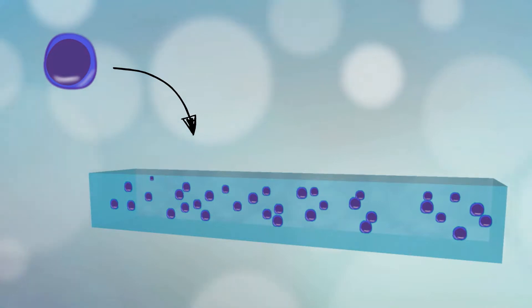Stimulated cells are introduced in a hydrogel and placed on a multi-channel microplate, all specifically designed and patented by BioHOPE to evaluate immunosuppressant efficacy.